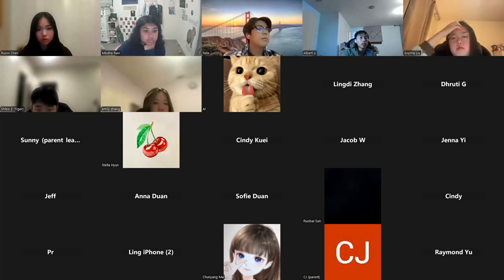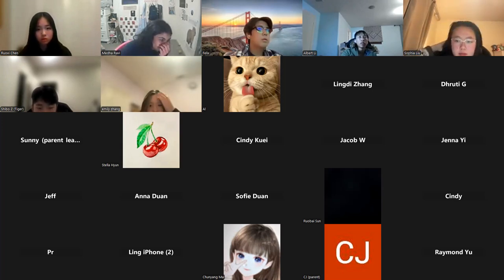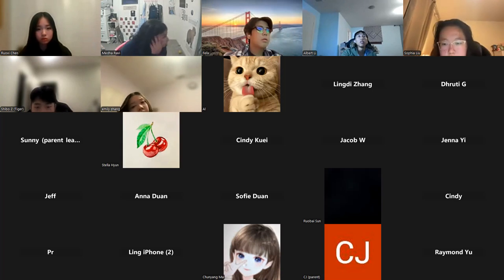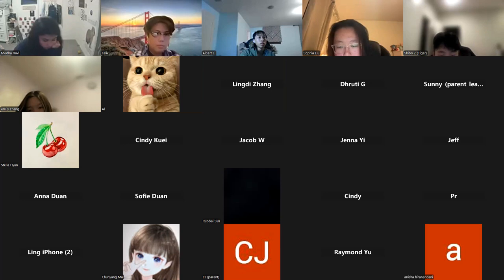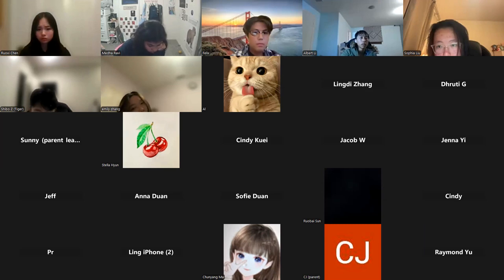Okay, so let's say you followed all of the steps in learning some basic Python and then going through with the downloading process of Cellpose. I'm going to go ahead and share my screen once again. Give me just a quick second to share my screen. I might just share my desktop.